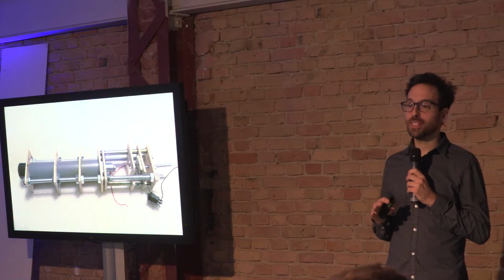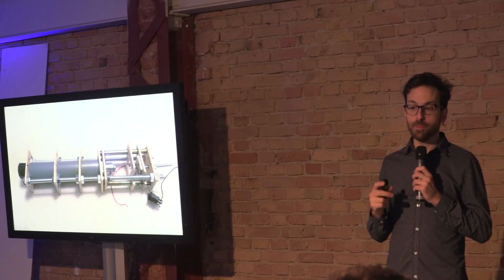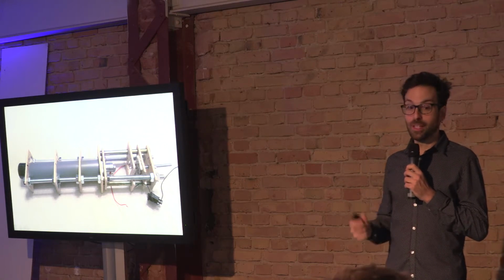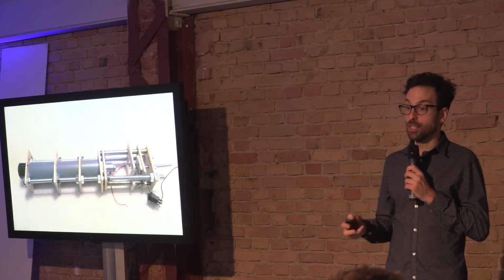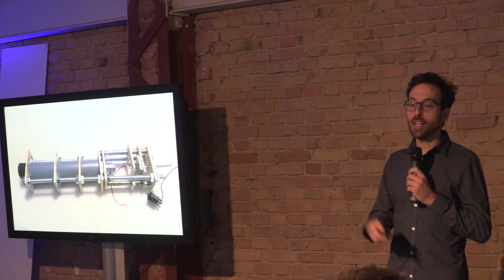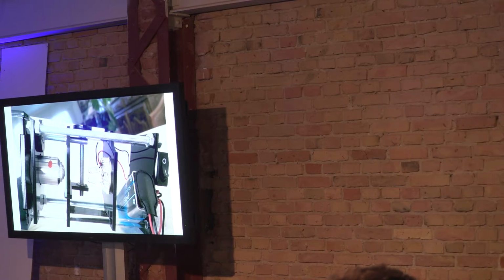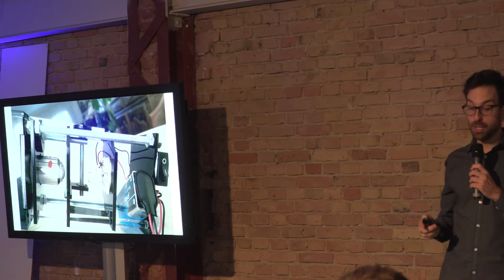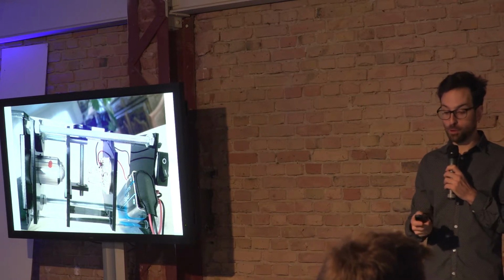The idea of AIScope is that it needs to be able to be manufactured everywhere in the world without the need of complex machines. That's why in the first version I used wood, because you can find it everywhere. It has wood, bolts, and an objective and an eyepiece that you can buy on Amazon. The cool thing is that the materials cost under 50 euros if you buy them on Amazon. So that was the first version. It kept improving, so it gets more complex. Here in the middle you can see the objective, and in the front you put your sample there, and it automatically moves everything because it has an Arduino that moves and refocuses everything.